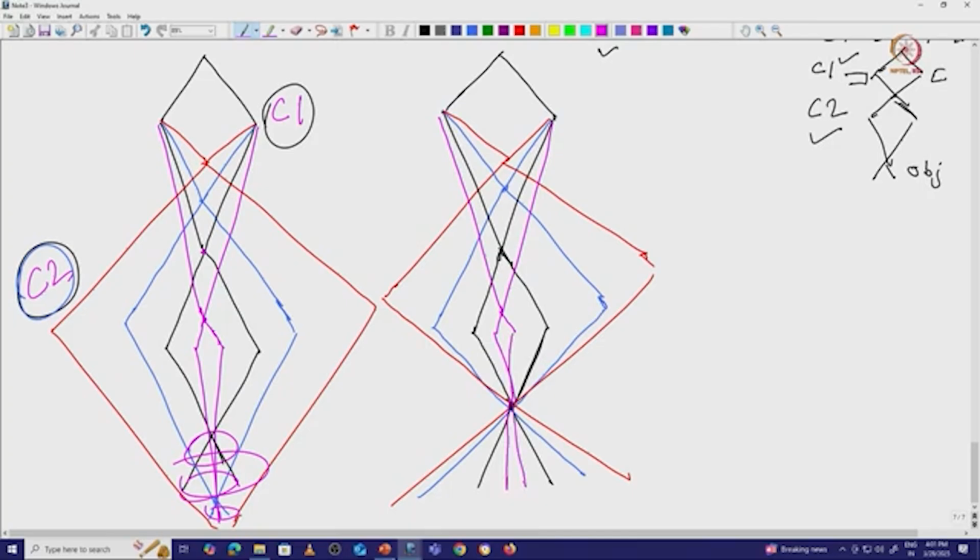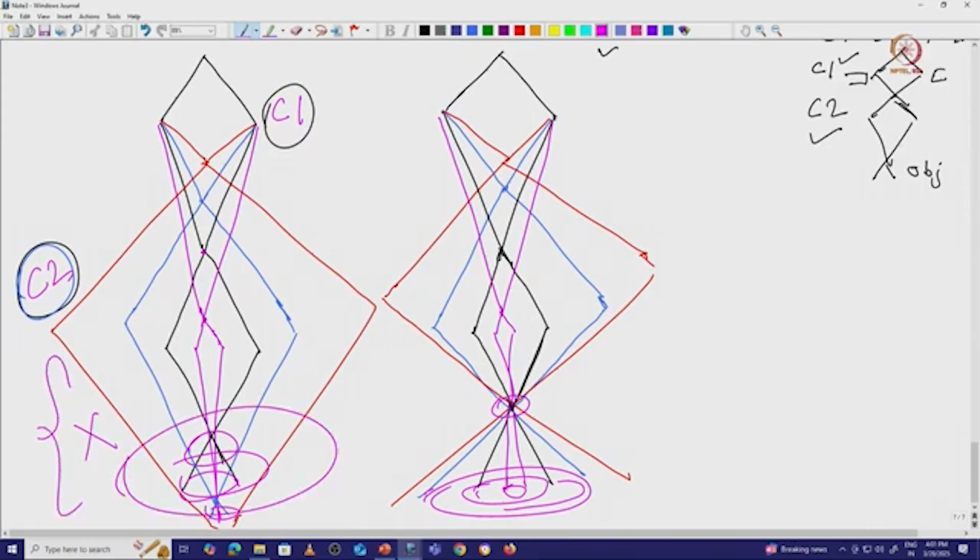So, in all the cases you can see, even when there is a fixed point, there will be some change in the beam diameter. It is not that the beam diameter will be fixed, but it is not going to affect things that much. Here it looks like there is no control. So this is not a very good setup, where we are only changing the C1.